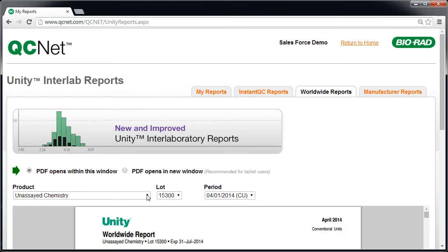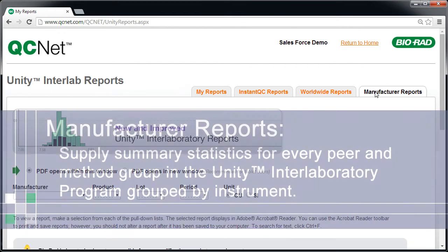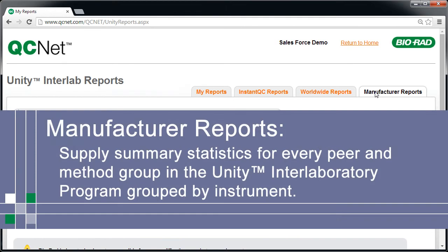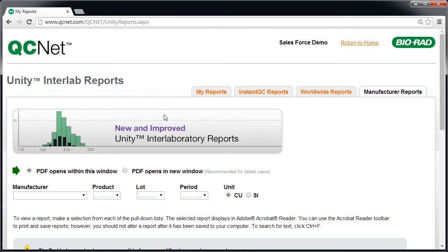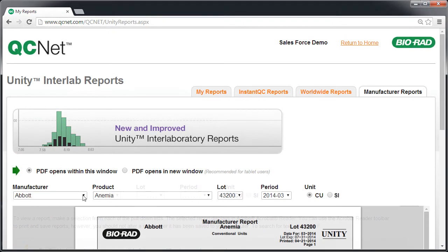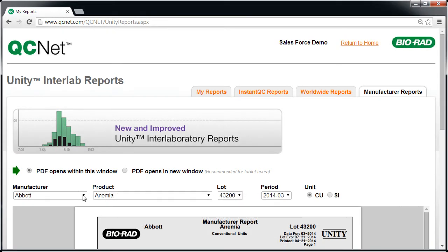Finally, Manufacture Reports provide summary statistics for every peer and method group in the Unity Interlaboratory program grouped by instrument. The Manufacture Report is a good reference when evaluating a new instrument, kit, or method.